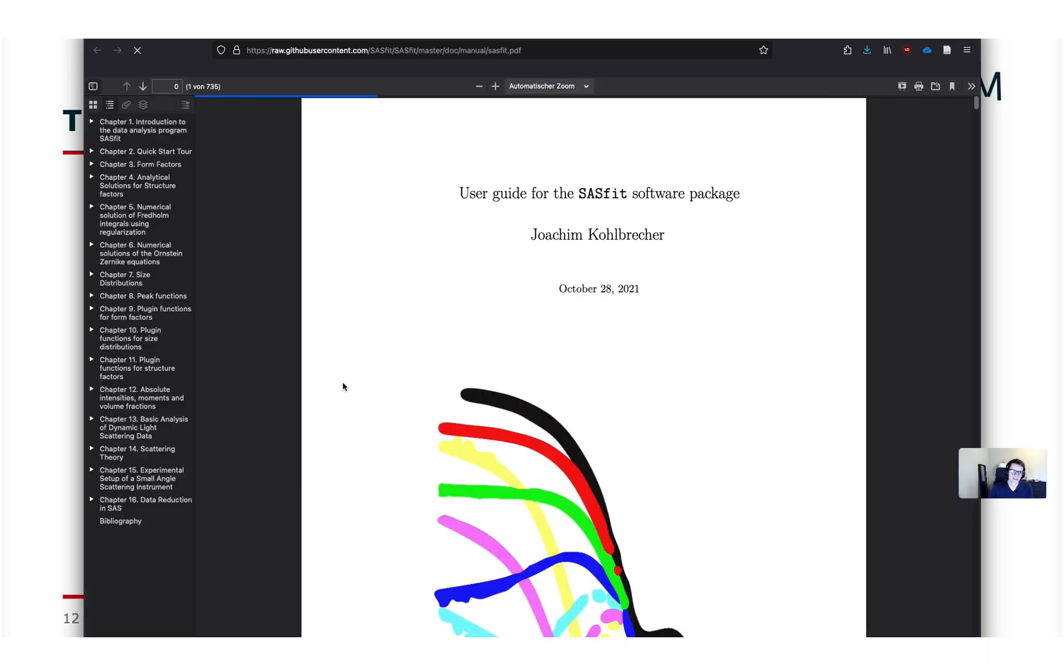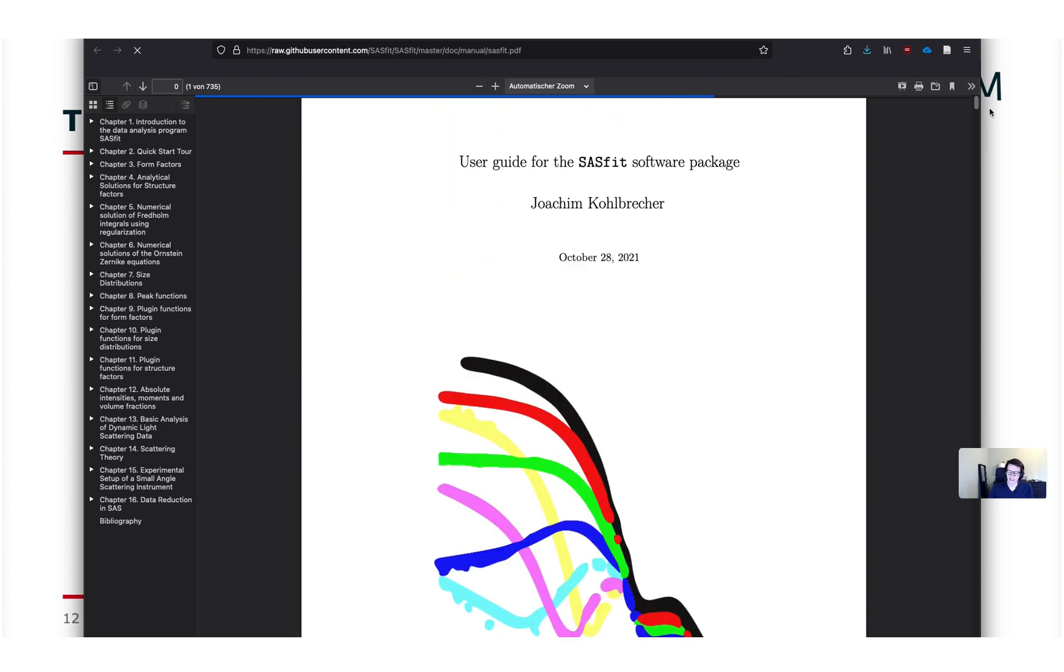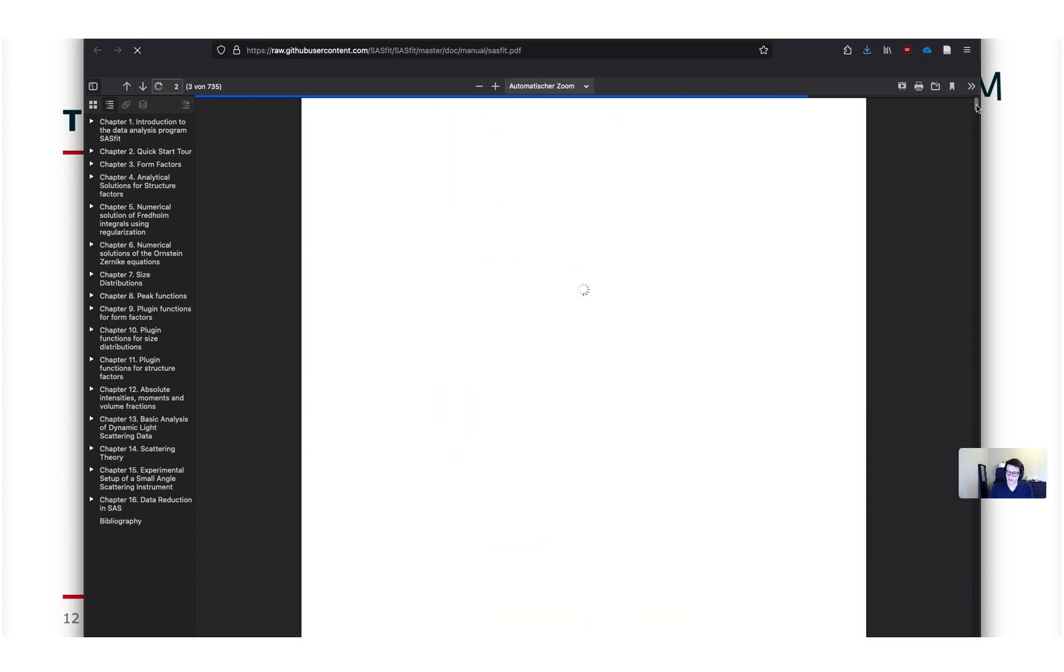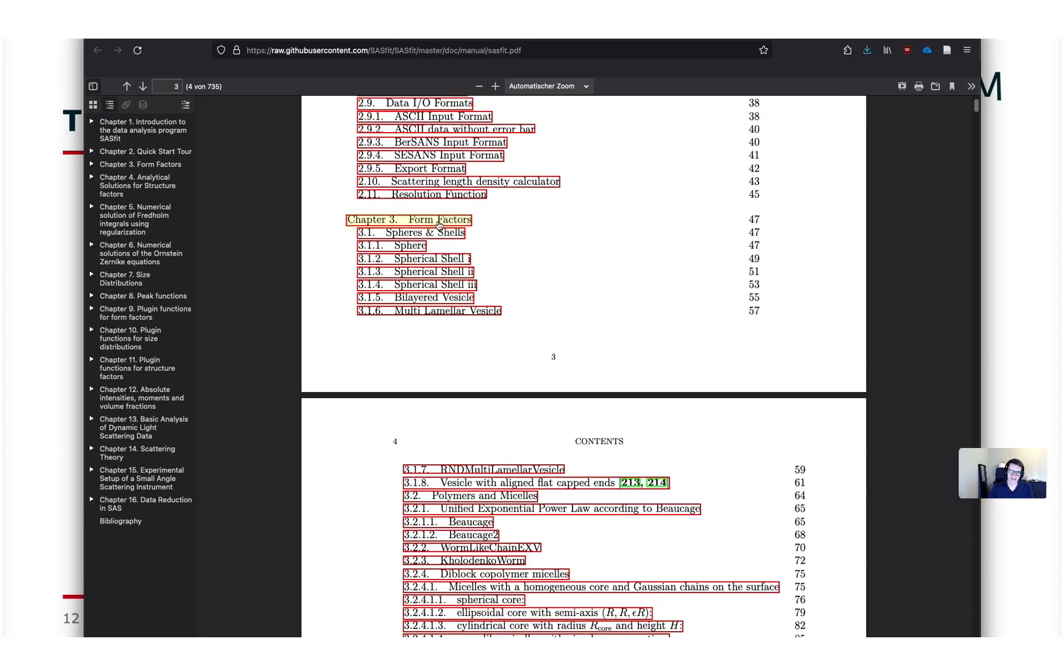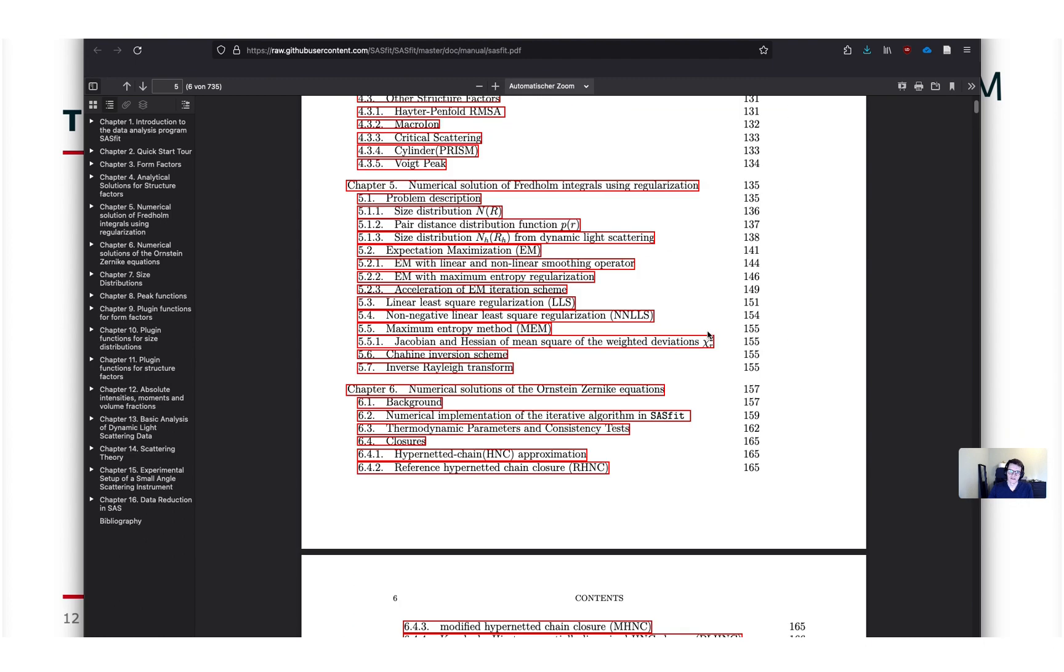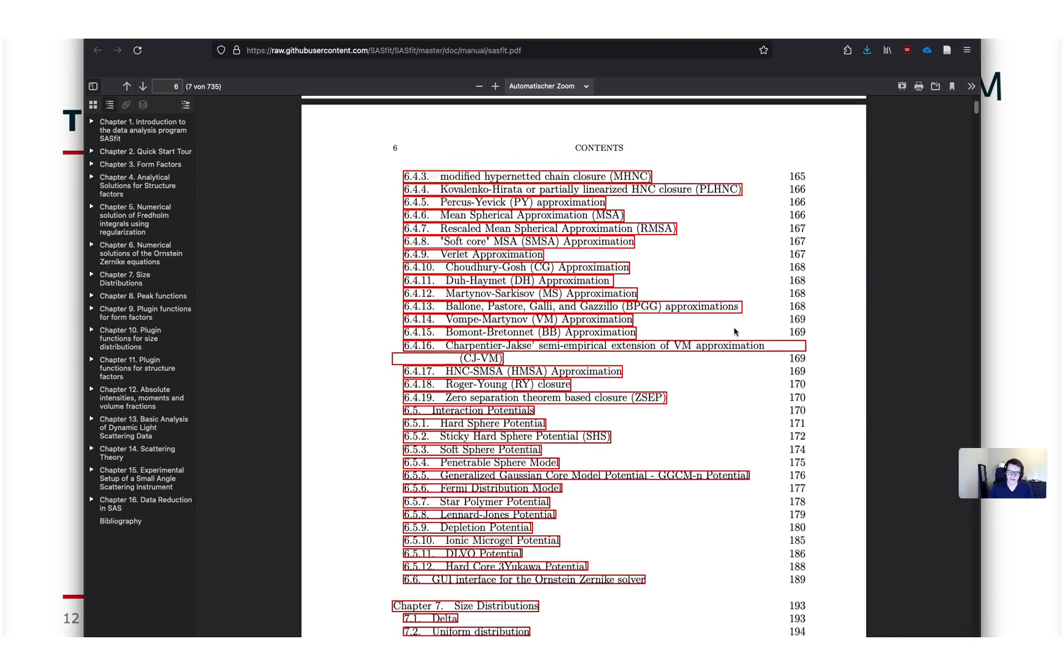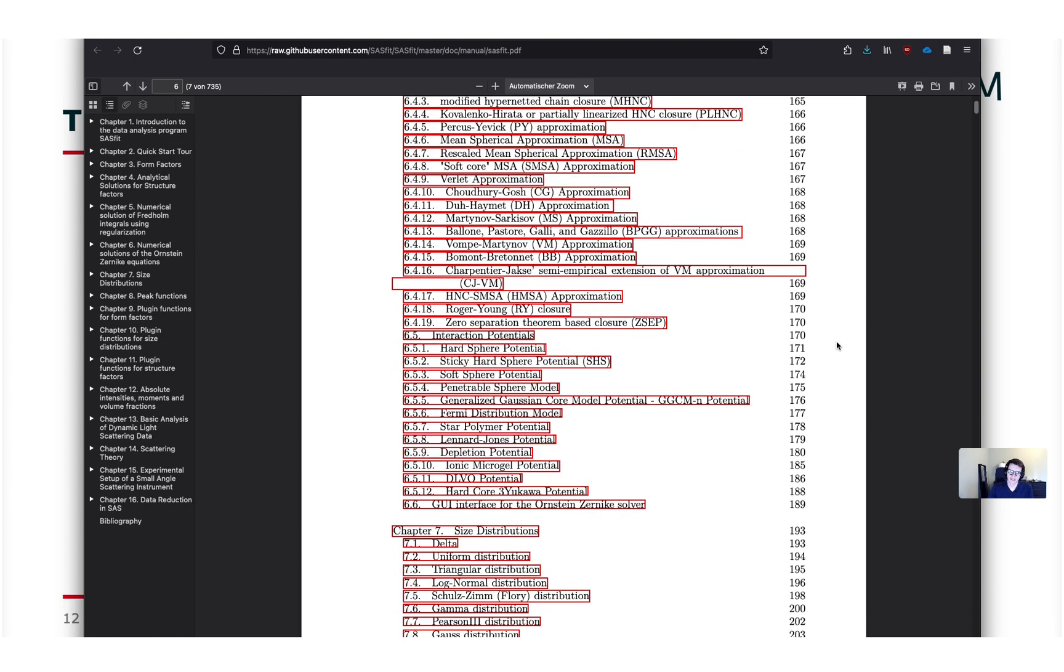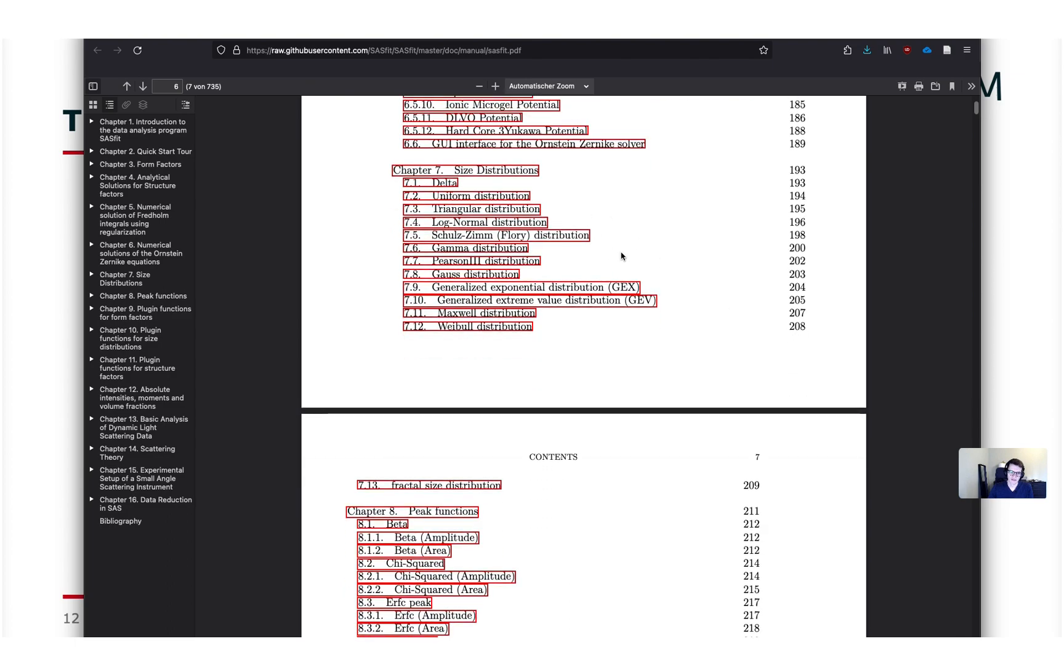It links you to the manual which is stored on github. It contains lots of scientific documentation of most of the models and implementations also for the structure factors for example. So let it load first. It's quite large. This is the form factors. Here's some overview of the regularization process and the Ornstein-Zernike solver and its equations. Many of the definitions and scientific backgrounds for that.